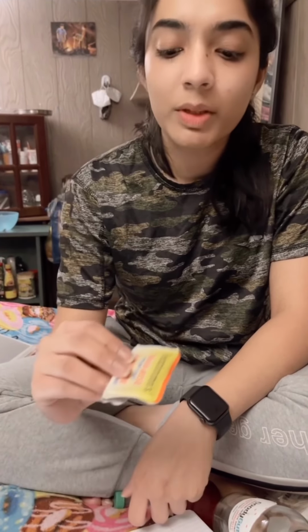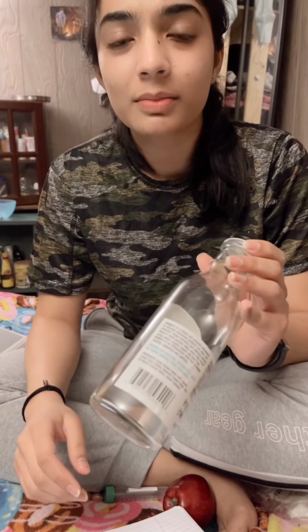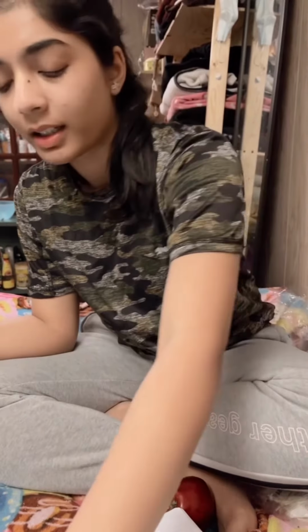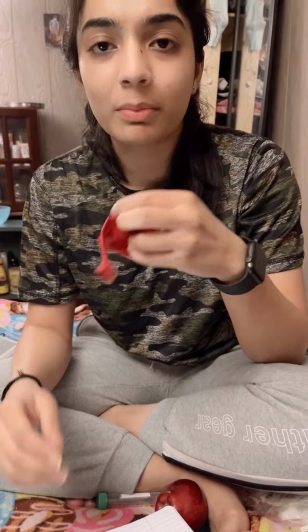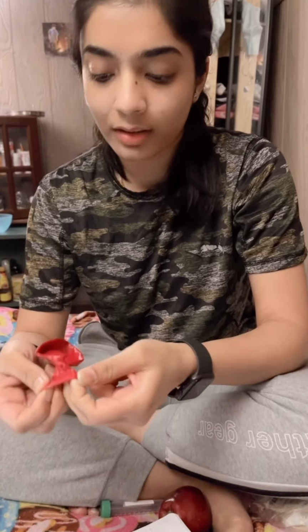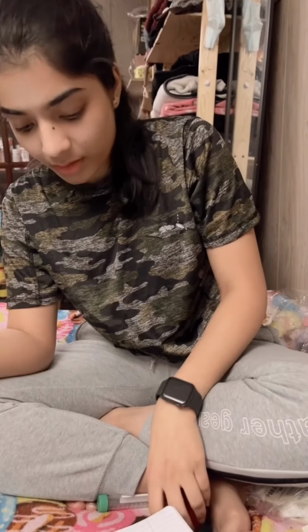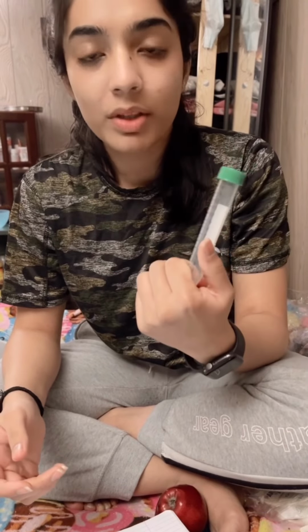So for the experiment, we'll be using this yeast and these glass bottles. We have sterilized these glass bottles using boiling water, and the apples we cleaned with hot water, and we will be using the mush of this apple. And these are the balloons that we'll be using to measure carbon dioxide. We will put these balloons on the top of each bottle, and then we will measure the carbon dioxide, and these centrifuge tubes we will be using for measuring the yeast.